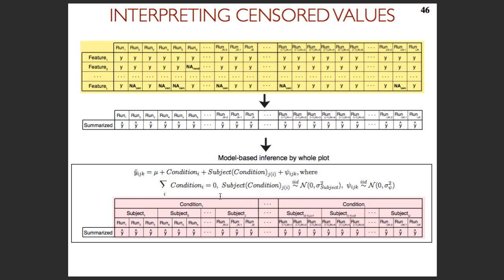The problem is that if you just calculate the median, those are missing values. No, they assign them to zero. You can do that, but depending on the pattern of missing values and outliers, it can affect things. And so let me maybe move straight to the evaluation. I will show you a little bit of the difference.